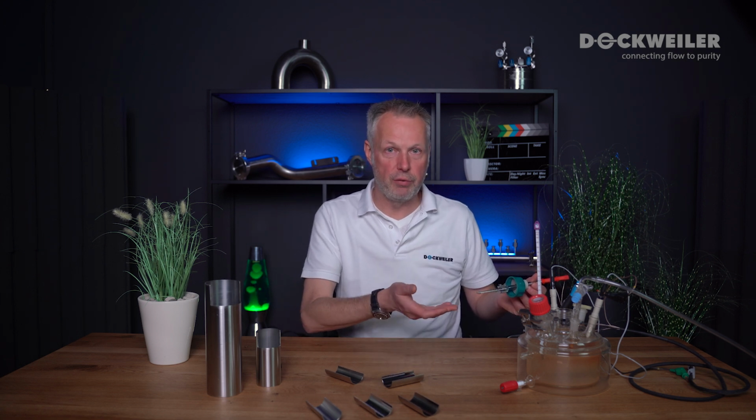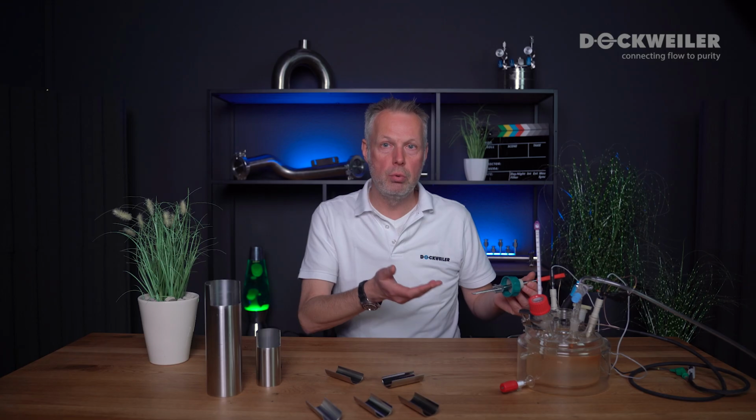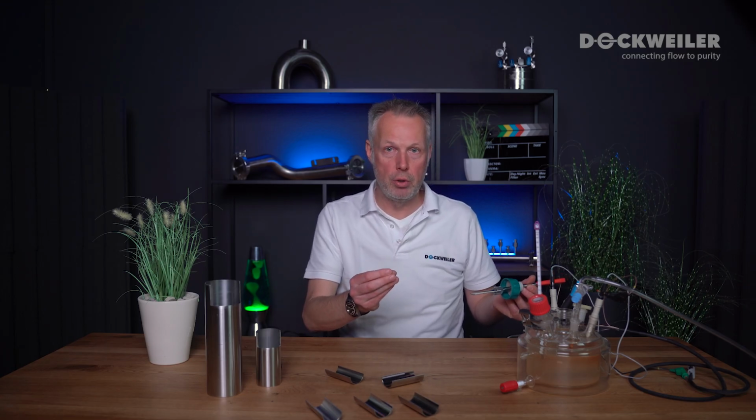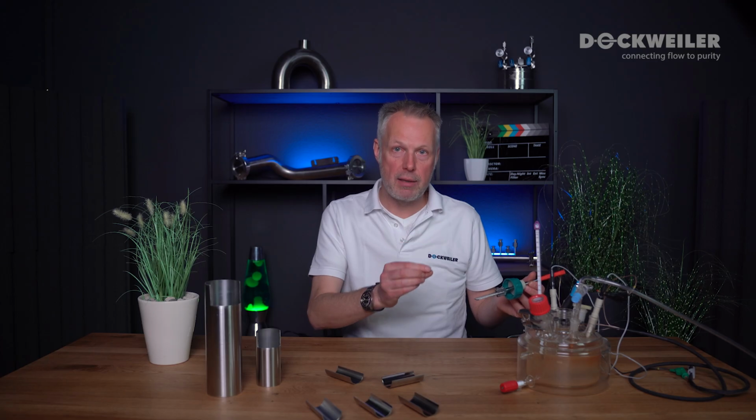So we want to figure out how soon and how fast pitting corrosion is happening on a surface. And this occurrence of pitting corrosion in dependence of the applied potential is giving us some indication on the corrosion resistance of the material in general.